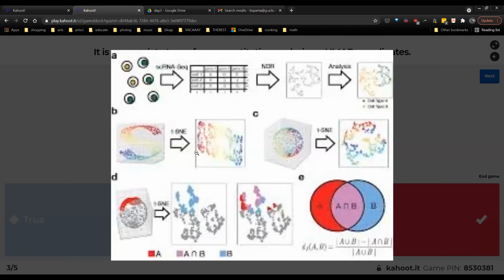Oh, and I'm sorry, this is an extremely granular image, but I think what I still see a lot in presentations of single-cell RNA-seq data and also in publications is clustering on this UMAP space. I think in general, there's a lot going on in single-cell RNA sequencing, a lot of statistics and different steps, and it's very disorienting.